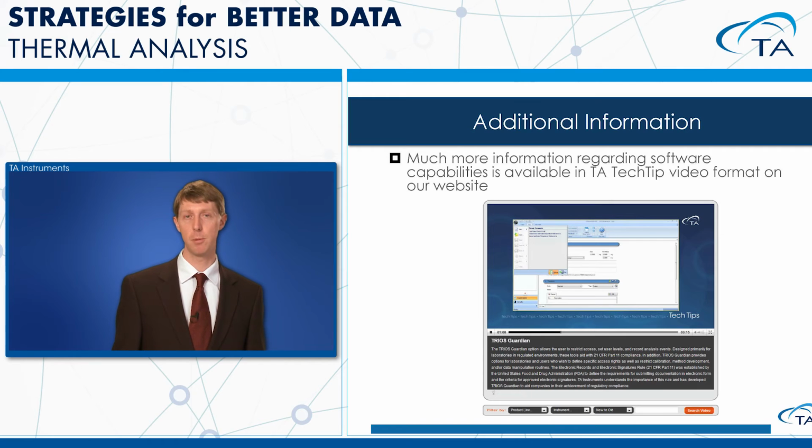Really, there's quite a bit of additional information in terms of utilizing TRIOS and Universal Analysis and Advantage to their fullest capabilities via our website and the TA Tech videos that we have listed on our website. They're also available on our YouTube channel. So you have the ability to see little tips and tricks on how to use the software, how to use the instruments, how to calibrate, change hang-down wires. There's a whole multitude of information available to you, all via the web.